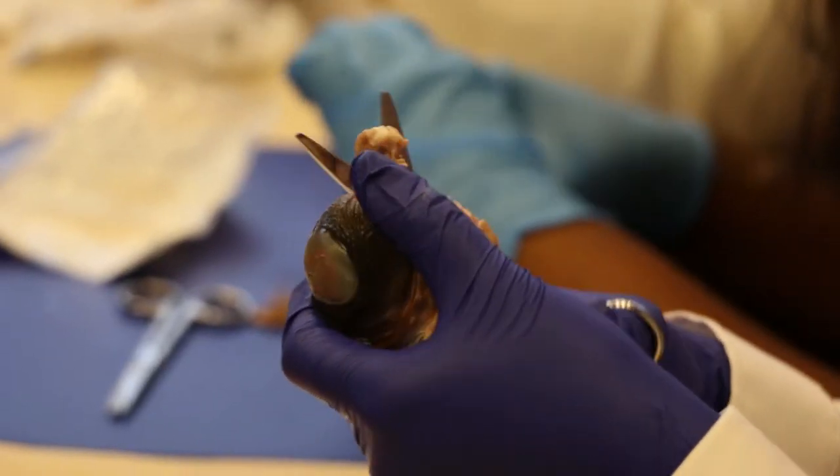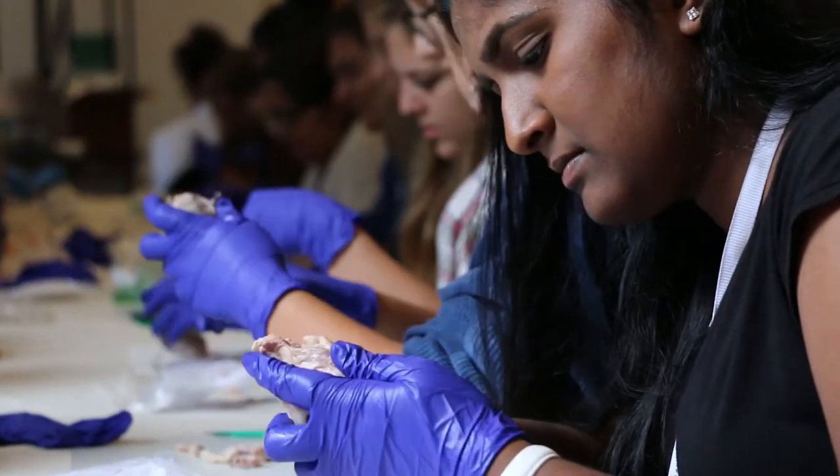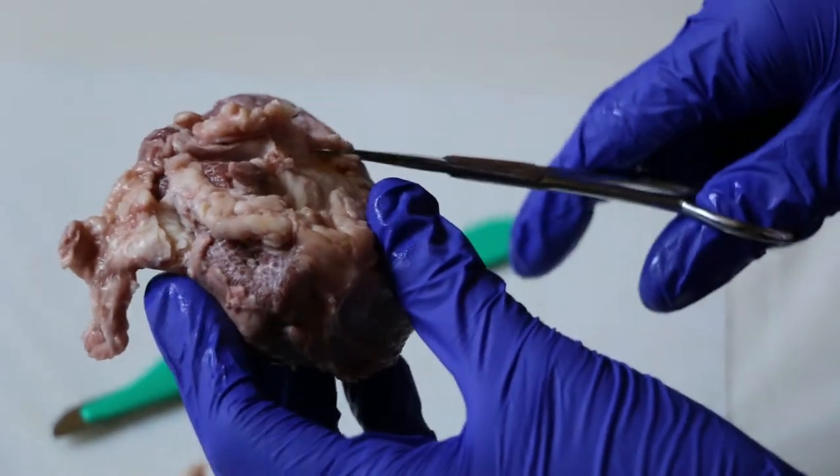I just dissected an eye. Once we opened it up, there was a little goo that spilled out — it was pretty fun. Pretty cool to see what we have. You kind of take all these things for granted about the eye. In your everyday life you just see things, but you don't really think about the mechanism behind how you see.